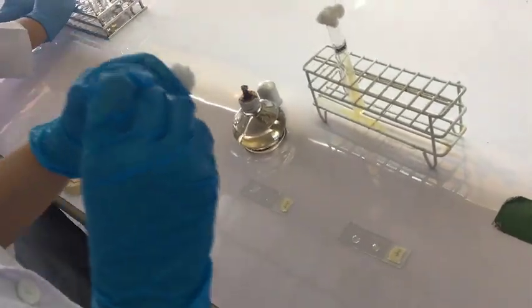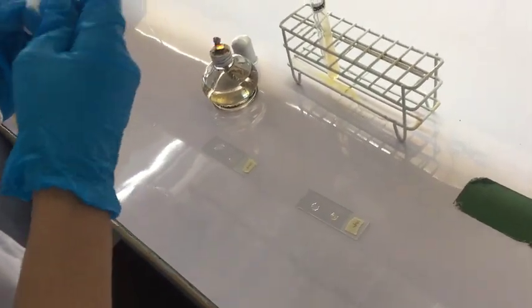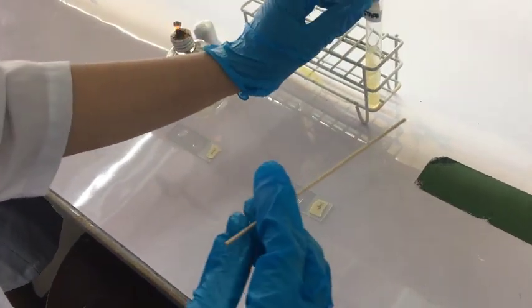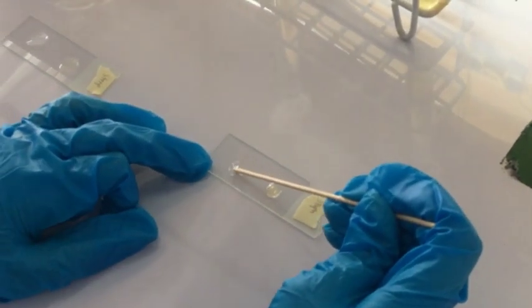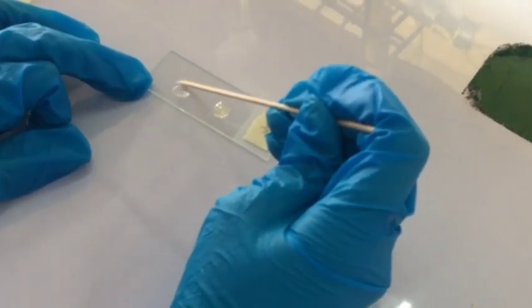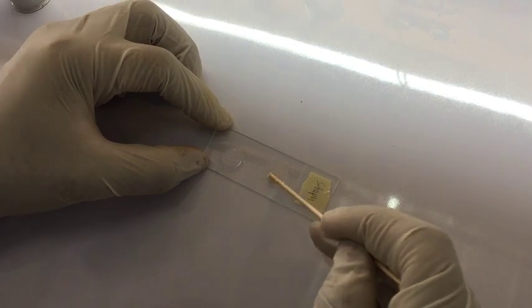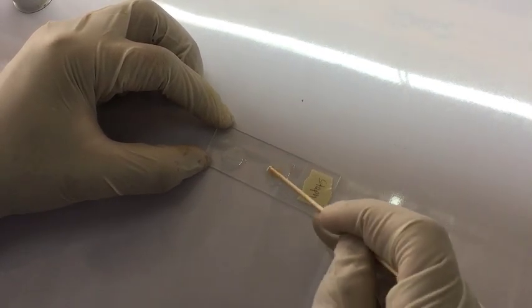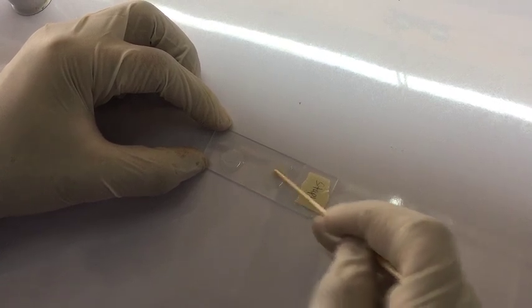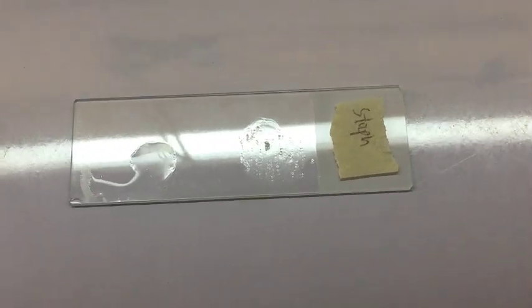Then, repeat the same steps for the organism Staphylococcus, always emulsifying the organism in the saline first, and then emulsify the colony in the rabbit's plasma. Mix well for 5 seconds, then observe for clumping within 10 seconds. Based on the results, clumping is seen in the Staphylococcus organism. Therefore, Staph is positive for coagulase test, while Strep is negative for coagulase test.